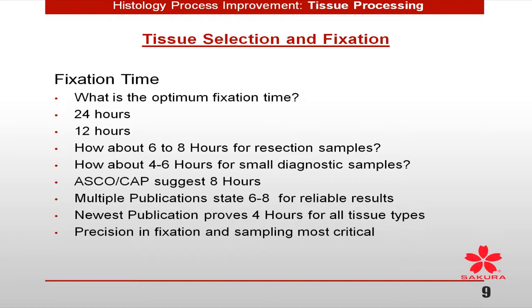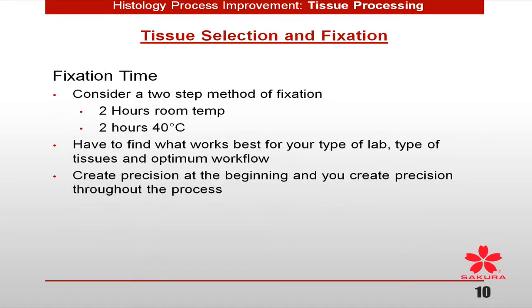If we didn't fix it correctly or create precision in that fixation protocol, we have too much variation. And then we often blame everything from the processor to the stainer to the tech. And most often it's just because we didn't spend the time at the beginning of our process that we spend at the end of our process.